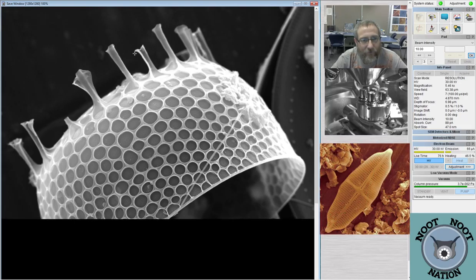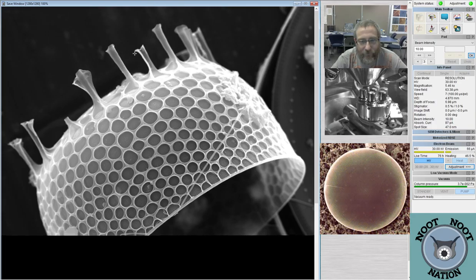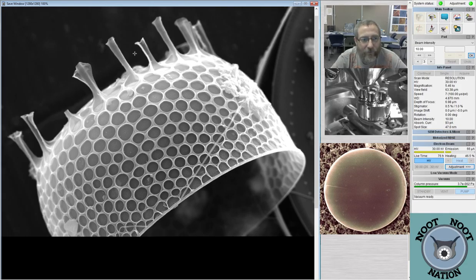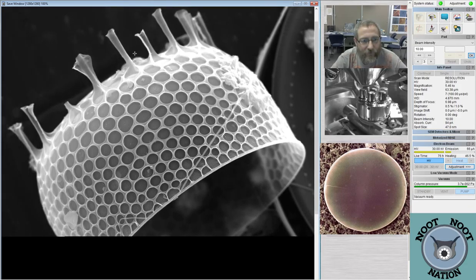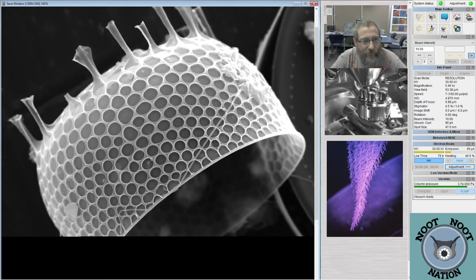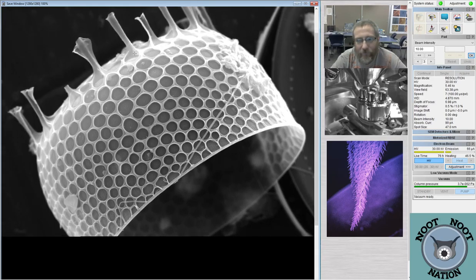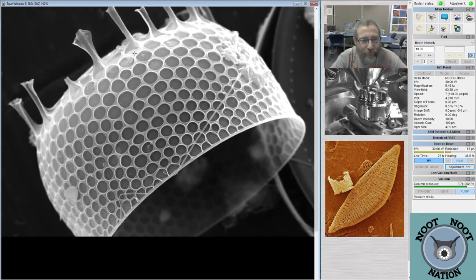Turris has only, just not Turris. This is Turris. Nipponica, the other one, has just, I think, four or six straight spines that come off, that interlock. It looks like a weird cross between Stephanopixis and Odontella. It's really strange, because it's round like Stephanopixis, but it has those straight spines like Odontella does. It's really neat.